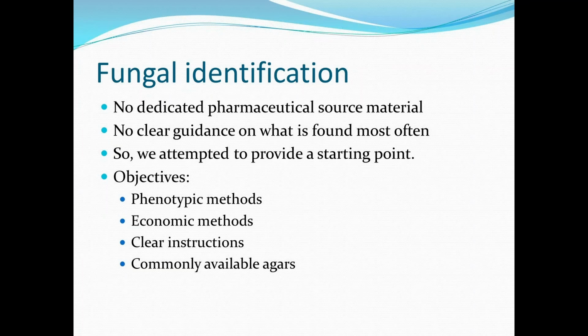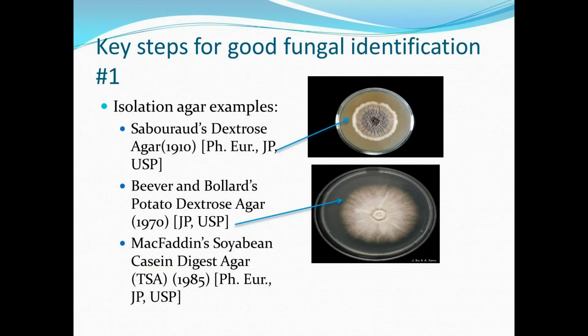So this involved looking at a number of key steps for the identification of fungi. First, it was quite clear that the type of agar can influence the fungal identification, and that different fungi grow better on different agars. So one of the things we set out to do was to try and match agars with different primary fungal contaminants.